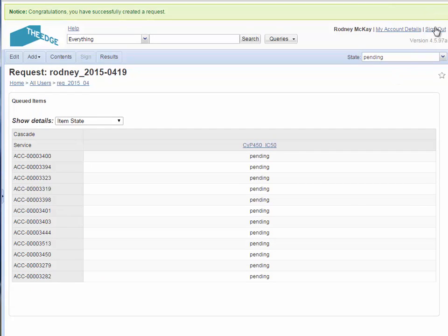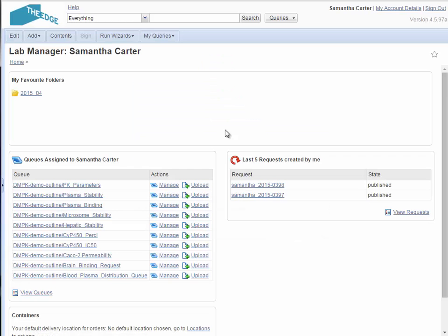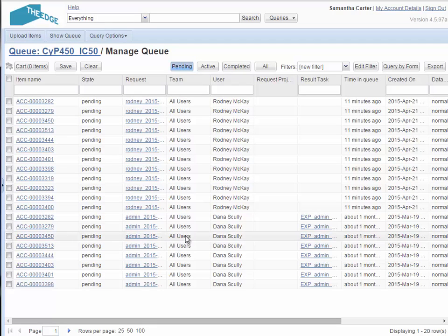I now log on as Samantha Carter. She is the DMPK team leader. She has access to the queues and it's her responsibility to manage them. I select the top samples that have been added to the queue and I can create a new task.